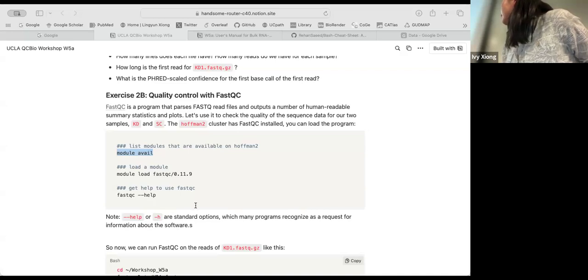And coming down, we have Cell Ranger, for aligning single cell sequences, if you need to do that. And SAMtools. That's something we will use tomorrow, handling the BAM files. SRA tools will be used on Thursday. We can use that to download publicly available sequencing data. We can have a look at others. Yeah, so that's the whole list.